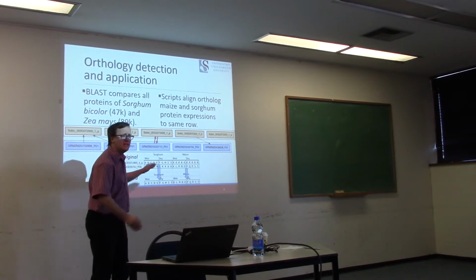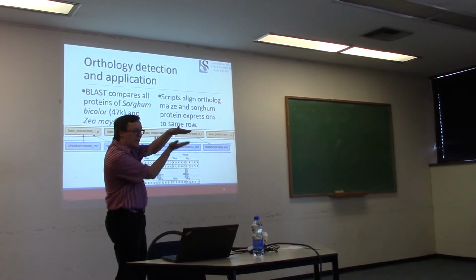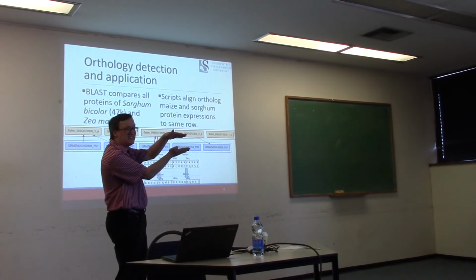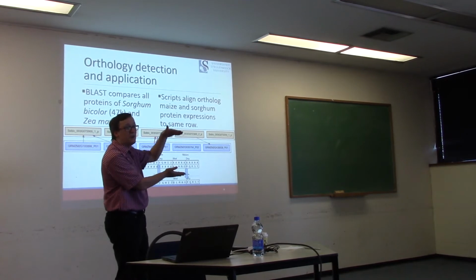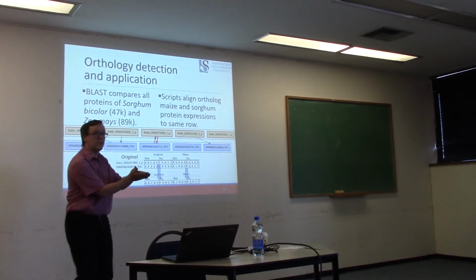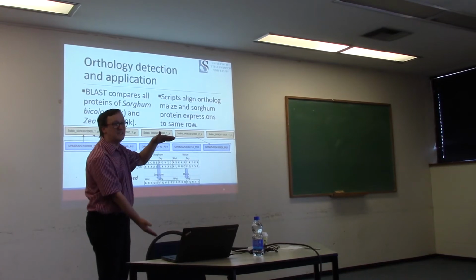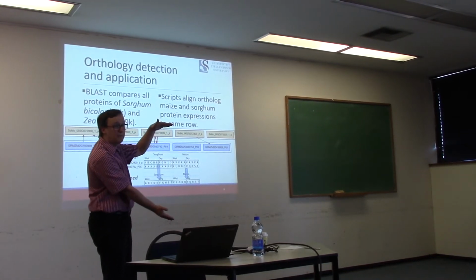The problem here is that the software sees the maize protein and the sorghum protein as differentiable from each other. They have peptides that allow us to tell one from the other, which means that the sorghum protein and maize protein are going to be listed separately in this massive table. And there's no guarantee they're anywhere close to each other in the ordering.